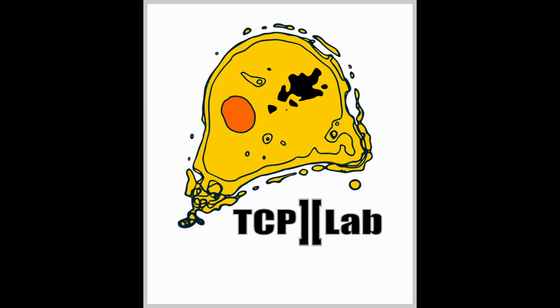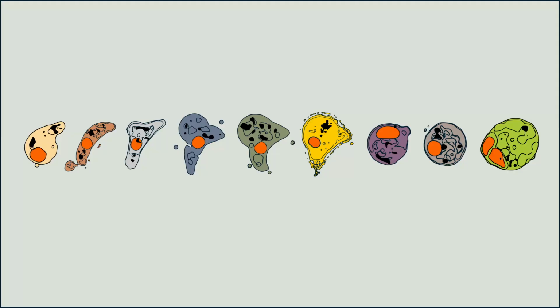This is my logo, but what is it, and what are these? For those who are curious, these are the differentiation stages that happen to the malaria parasite after it invades the mosquito midgut. And now I'm going to show you how I came up with this from this.